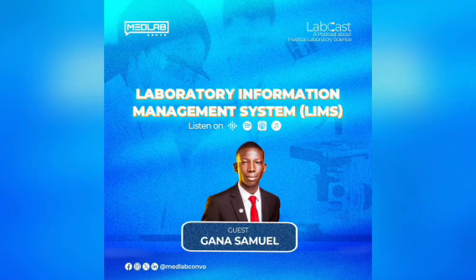So we don't make mistakes because, again, each sample is barcoded and the machine knows what it's supposed to do, such that when you look at one of the functions of LIMS, there is a bidirectional instrument interface in which it works. So what it means is that the LIMS is a server, right?